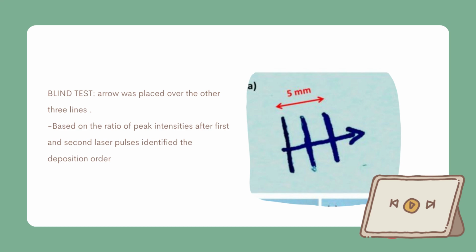The other one was identified correctly by using PCA analysis, while the missing answer could be attributed to locally very thin ink layers compared to the laser ablation depth.